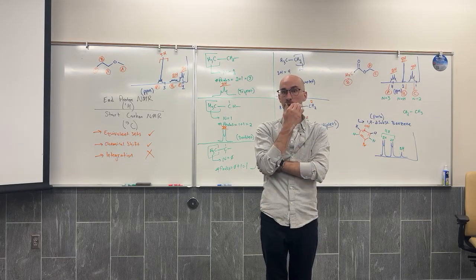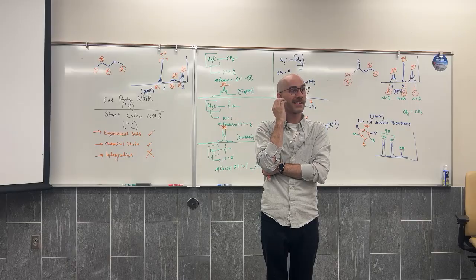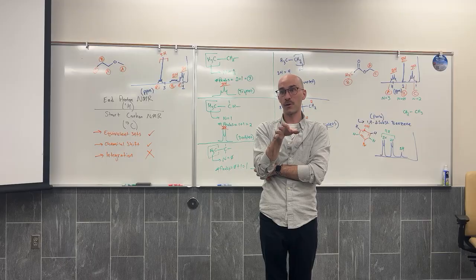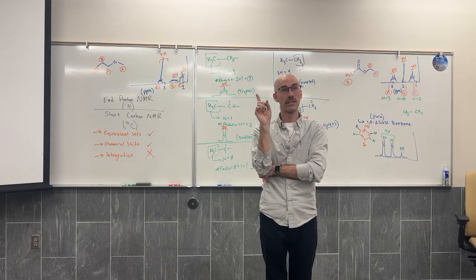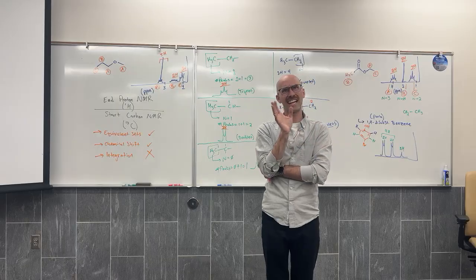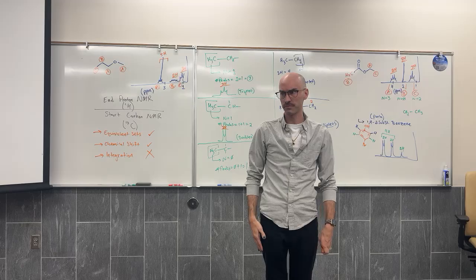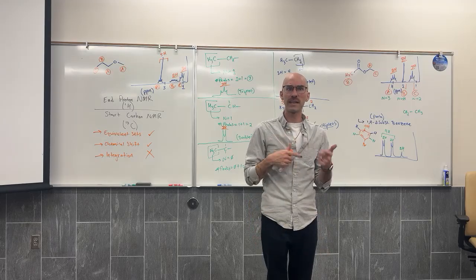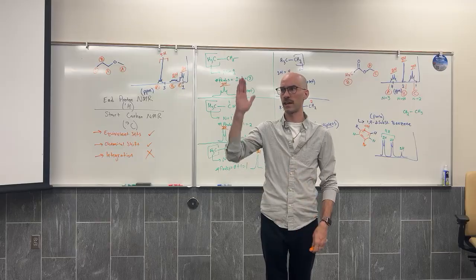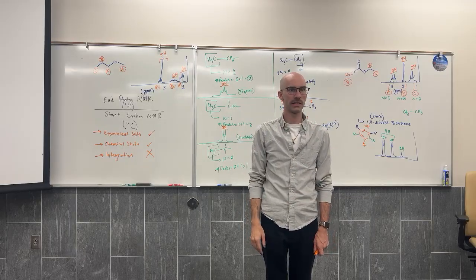Somebody watching this on the internet will probably tell me I'm wrong, because I might be. I am saying this a little bit out of my depth because it's weird what carbon NMR does. But there are types of carbon NMR where you can distinguish CH3 carbons from CH2 carbons from CH carbons, and I think maybe from carbonyl carbons, because of whether they go up, down, or don't show up at all. So there are different ways that you can analyze carbon NMR, but we don't integrate them. You'll never see a carbon NMR that has 1C, 5C, 3C written on it. You'll never see it.